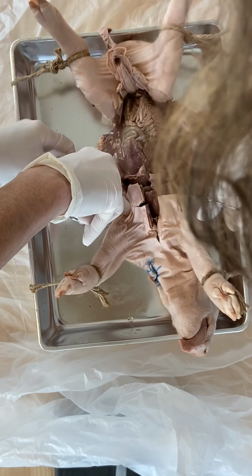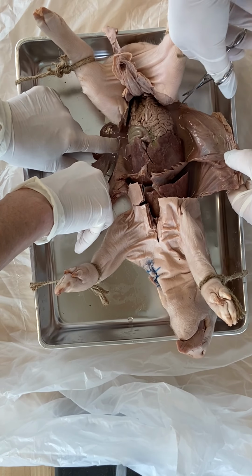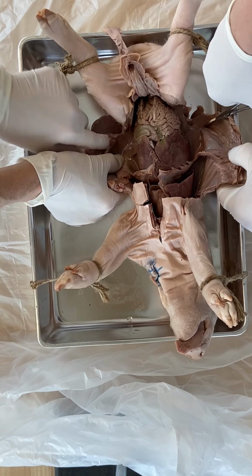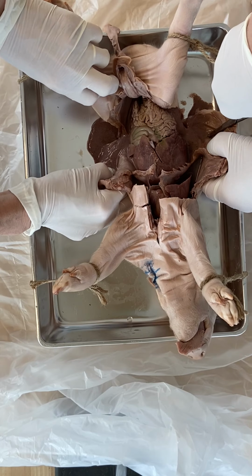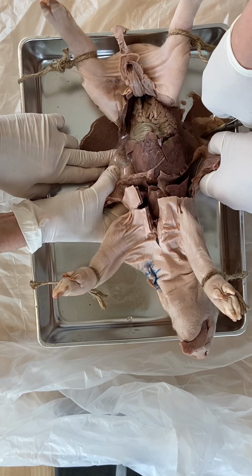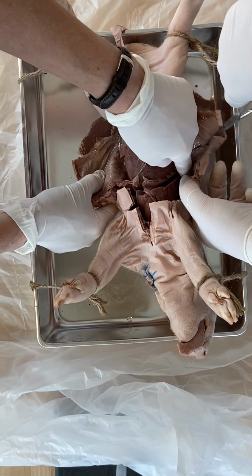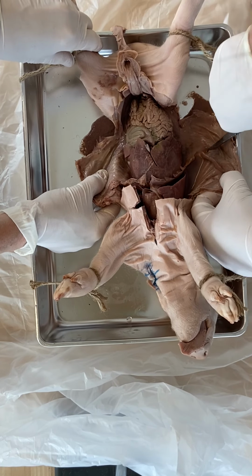Oh, it's those ribs going. There we go. Oh, he's a nasty, yucky one, huh? Yeah. There we go. Well, you're a lot more watery than me. I'm quite thick and milky at this side. It was really thick at first here, too. It was this that came down. And let me cut through the diaphragm there. Look, there we go.